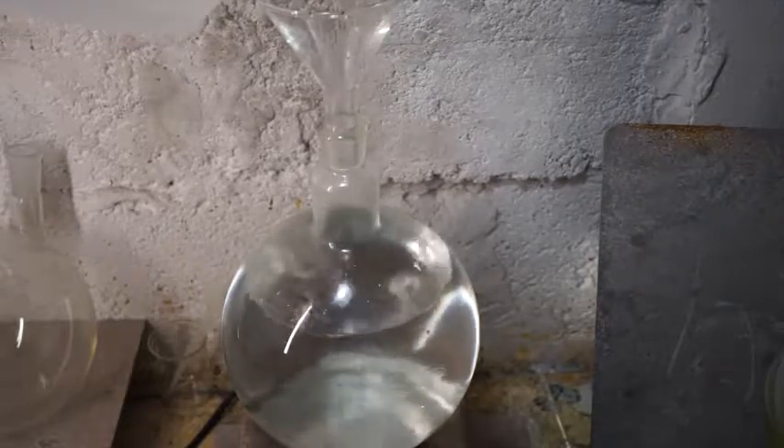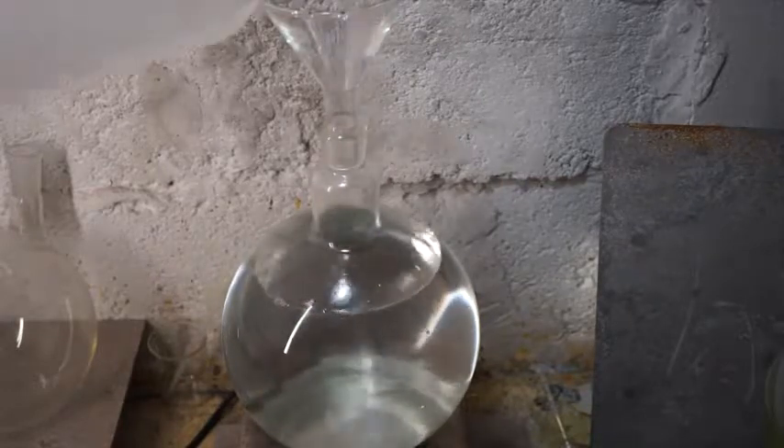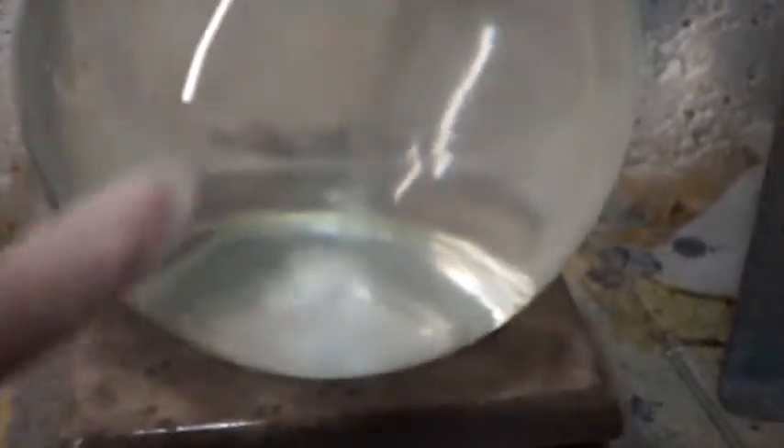You can clearly see the two miscible liquids have formed a nice separation layer. The bottom silver nitrate solution is being spun by my magnetic stir plate and the distilled water is just sitting on top.